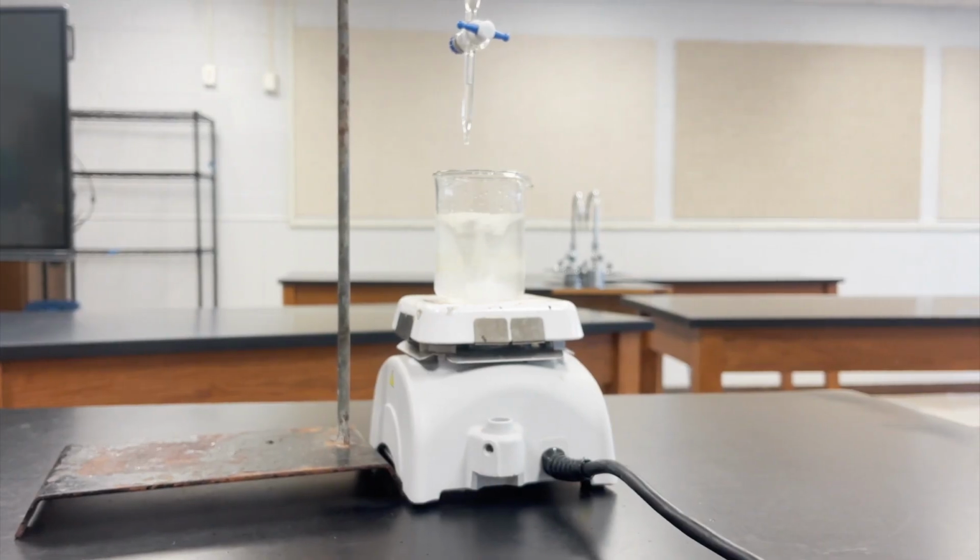Now what we're gonna do is start adding quantities of 1 milliliter. All right, so we're gonna add quantities of 1 milliliter until we get to a point where the pink starts to linger. And so you'll see what I'm saying here. So we're gonna start adding quantities of 1 milliliter.